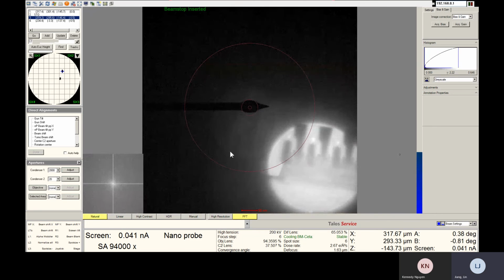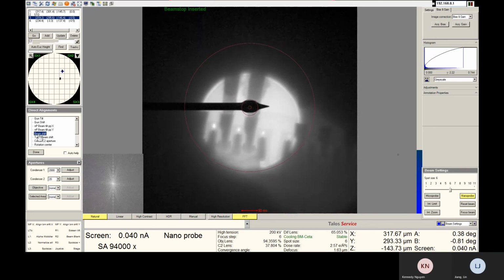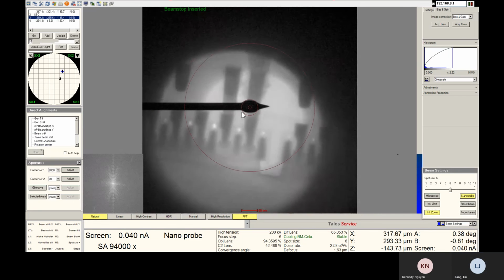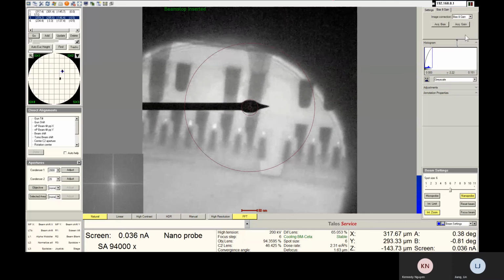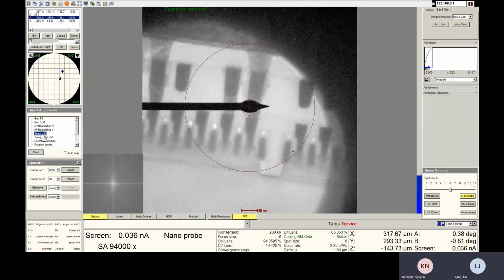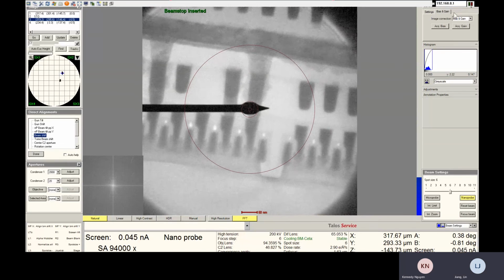Yeah, you still set up this region. Any questions? No, it looks good. I think I get a better idea. But the nanoprobe and the microprobe, the difference makes it very clear. So that's good.